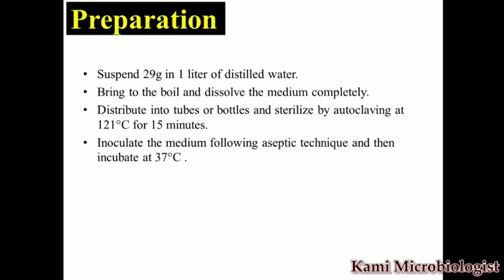Now let's see the preparation of this media. It's very simple. You need just 29 gram of powder in 1 liter of distilled water. Then you will mix it. After that, you have to boil the media to dissolve the contents completely.